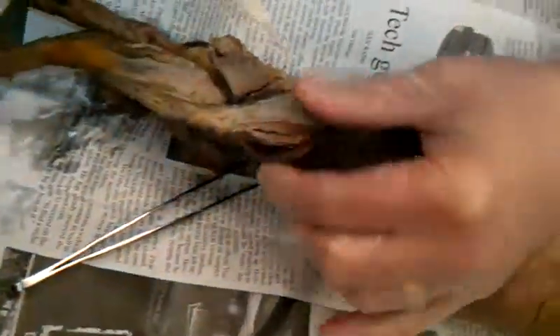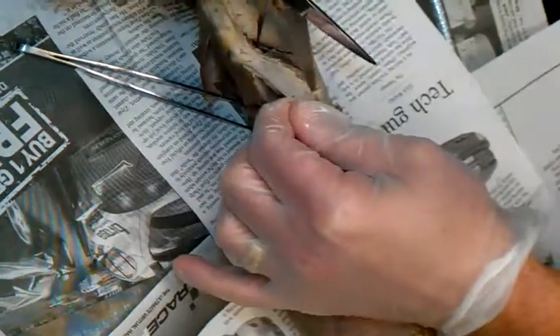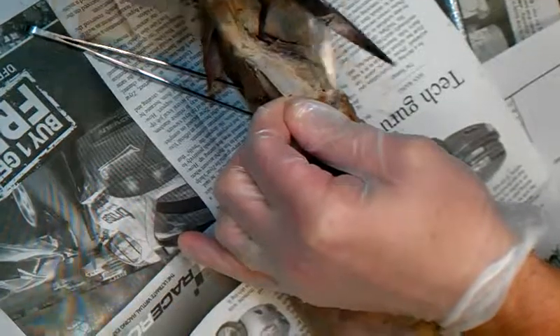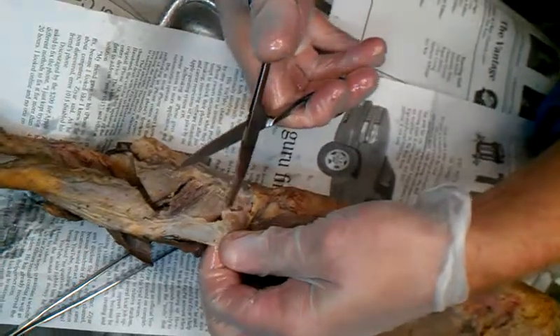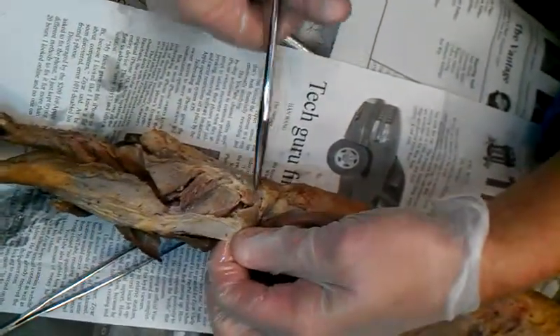I'm going to work a little faster than I should, so I'm probably going to do a little damage to it to get through that. The tensor fascia lata really only connects in one little spot. So underneath there, now I can see the gluteus muscles. Those are all glutes.